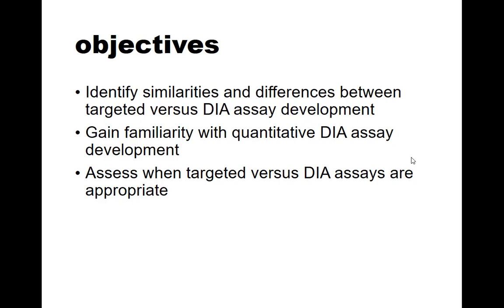able to tell what the differences and similarities are between a targeted assay development and a DIA-based assay development, so SRM or PRM assay development versus a DIA assay development. I'd like you to gain a little bit more familiarity with a quantitative DIA assay development pipeline.